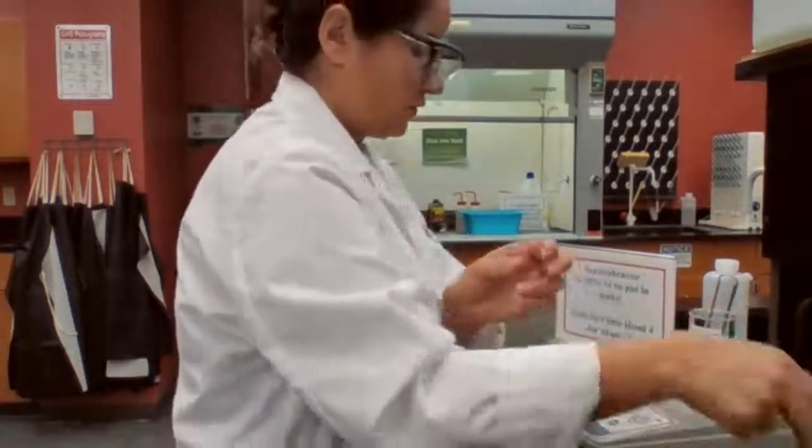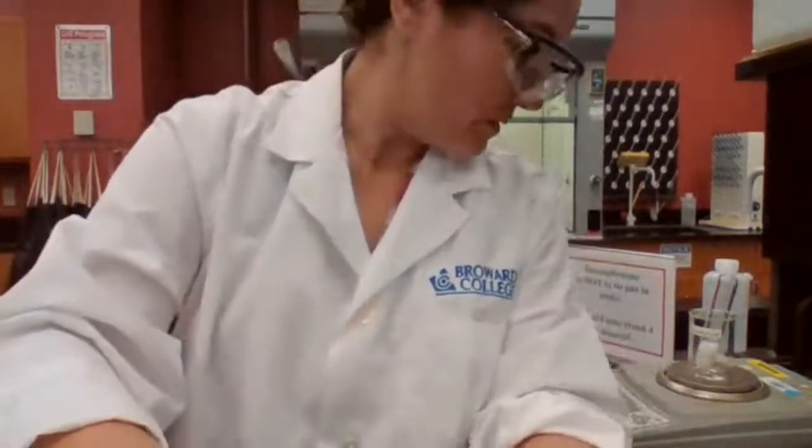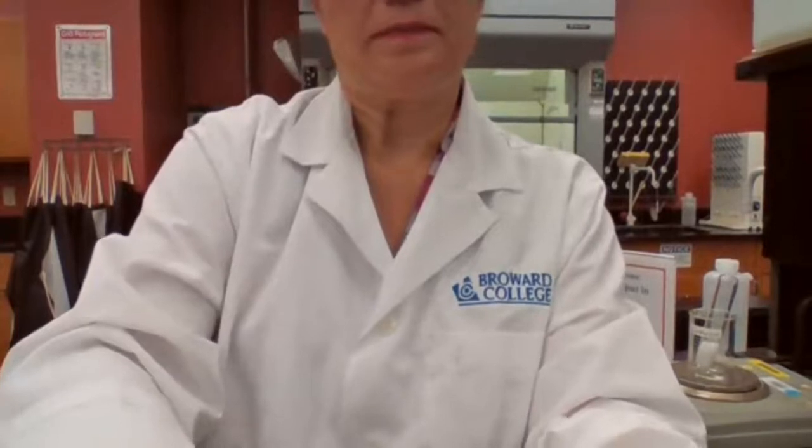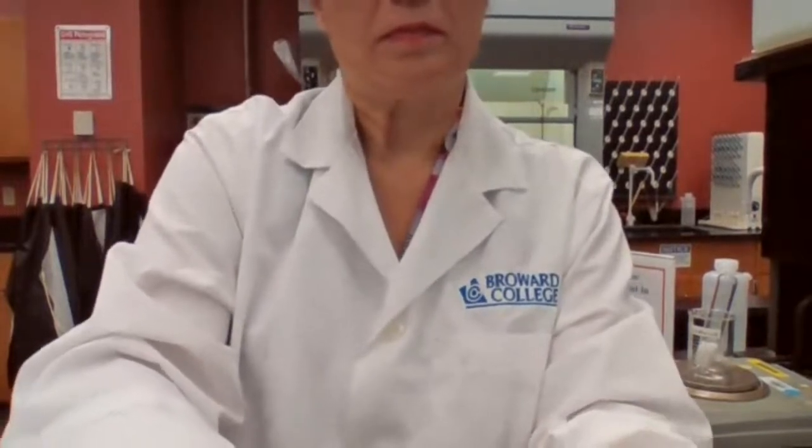So we have the mass now: 34.249 grams. This is the mass of the test tube with benzophenone.